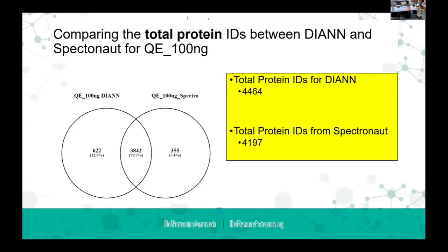How can you upload a database and run DIANN with it? Yeah, any database you can download, a FASTA file, right? But do you need to get the database ready from the source, or work on it to create a spectral library? No, just a FASTA database you download from Uniprot or something, yeah.